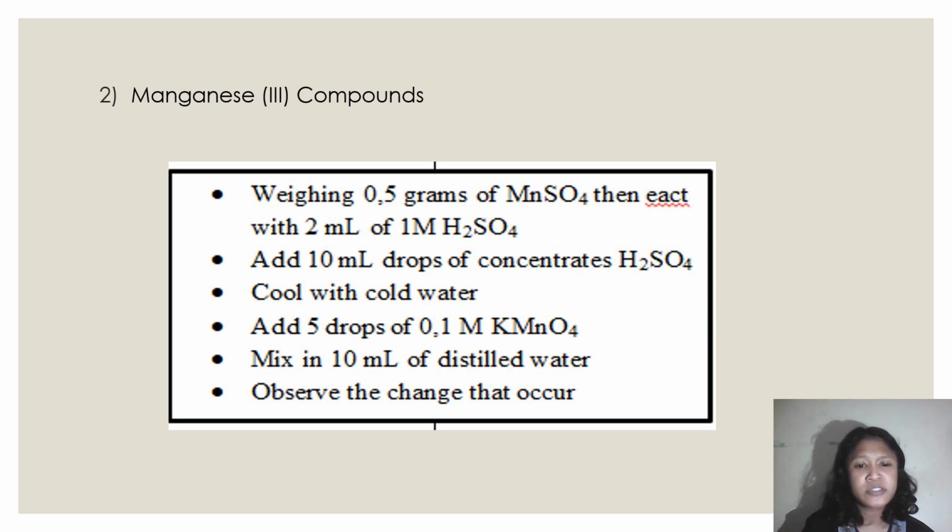Third, add 5 drops of potassium permanganate, then mix in 10 ml of distilled water and finally observe the changes that occur.